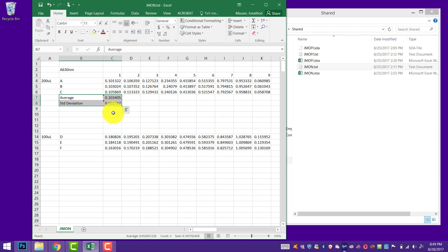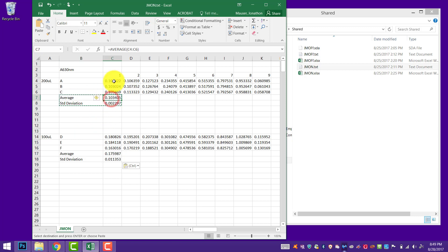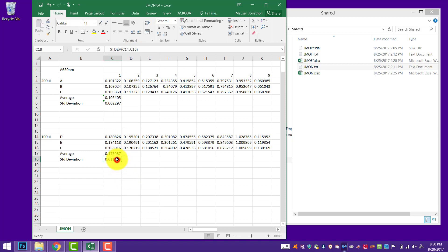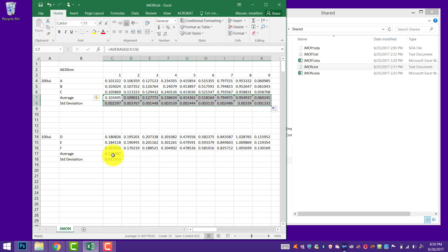We can select those two cells we've just done and paste them down so we can do the same exact math. Excel will say the three above me are being averaged for this well. If you copy those, it'll keep that same relative position. We can also select those two cells, and when your cursor turns into a solid black cross, drag it all the way across — and it'll do all of our math for us without having to copy-paste a million times.